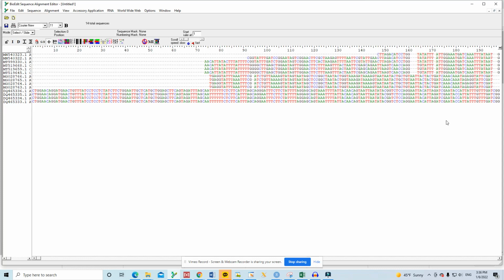But we want to have a common ground for them so that we can compare. To do that, you can simply come here by clicking on this to show, for example, the four sequences on Aedes albopictus. Here, all sequences are similar. As you can see, it is C throughout down here.